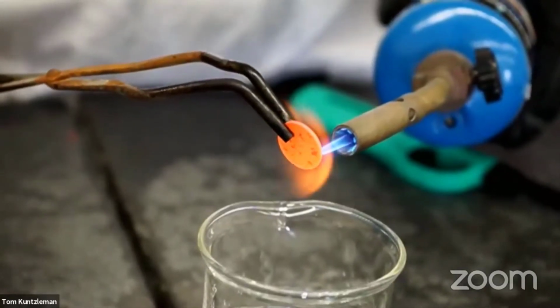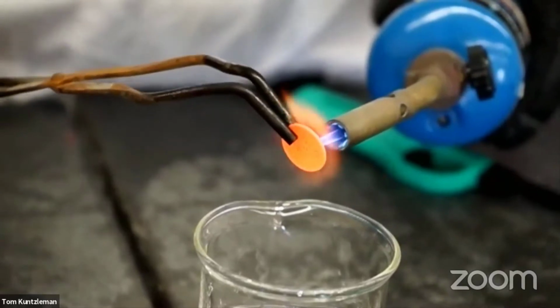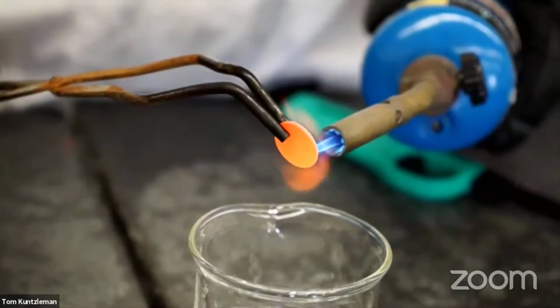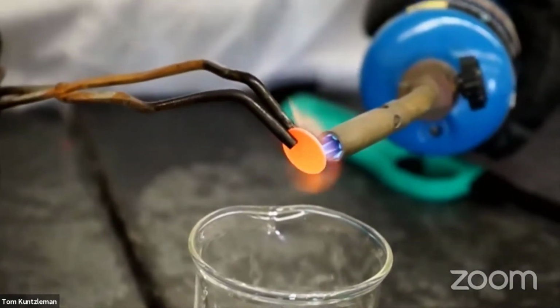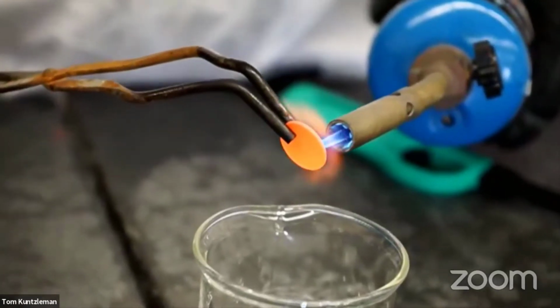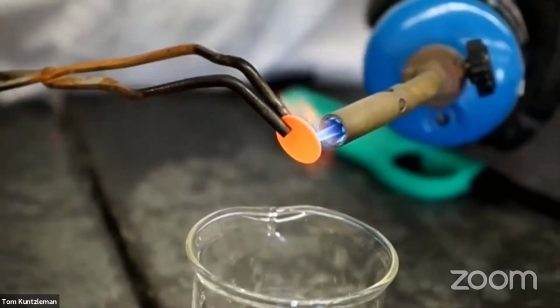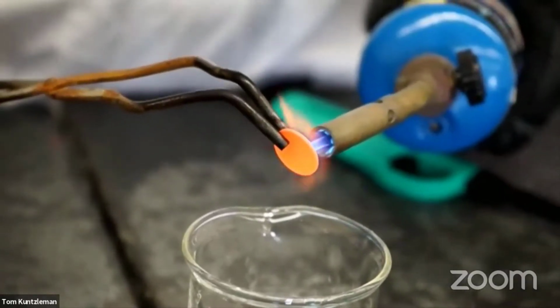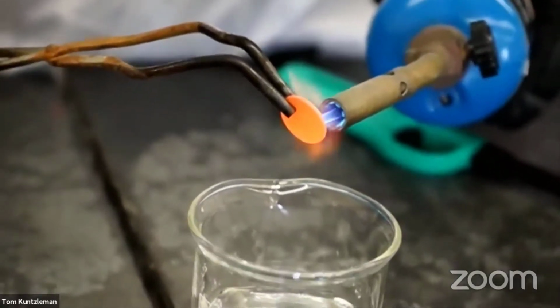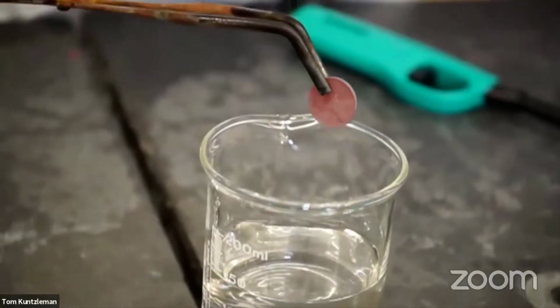Well, that actually makes sense to me because old pennies were made of copper. There's a little bit of zinc in there too, but it's mostly copper. Look, I'm still heating it and it's not melting. That's because the melting point of copper is 1,083 Celsius. It is way up there. It's very difficult to melt copper, even with this blowtorch. Now, I want you to watch this carefully. I'm going to pull this out of the flame, and let's see what happens to the color of the penny. Move it away. See what happens.